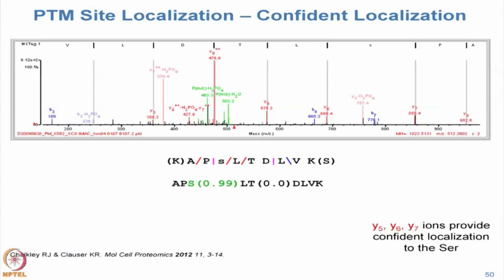No, they should have been labeled. Okay, this is going to be a 113 gap, this is going to be a 167 gap, and then 97. So that can place the phosphate on that serine, not on that threonine. This gap over here is going to be 101.